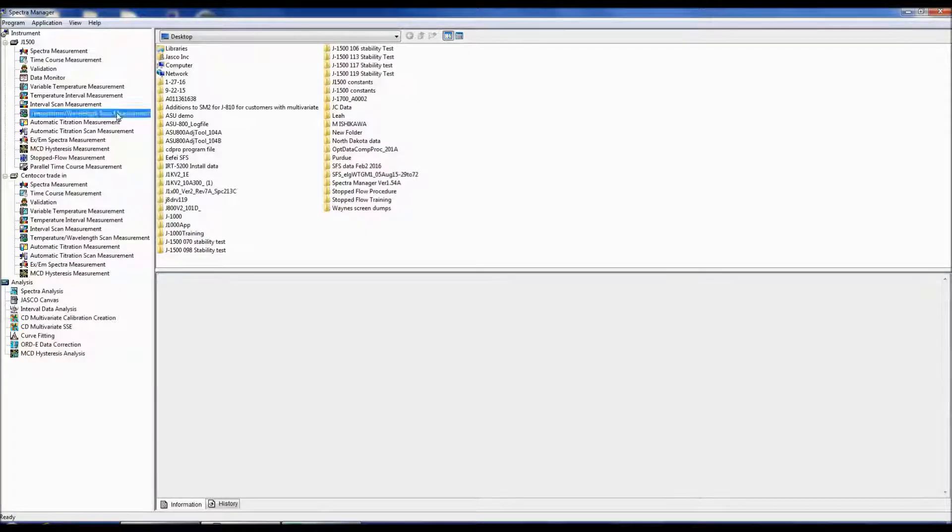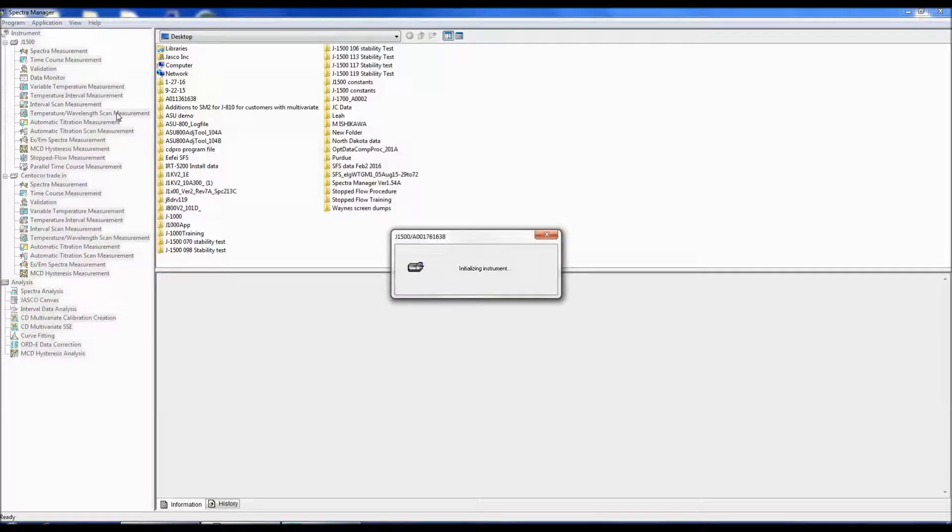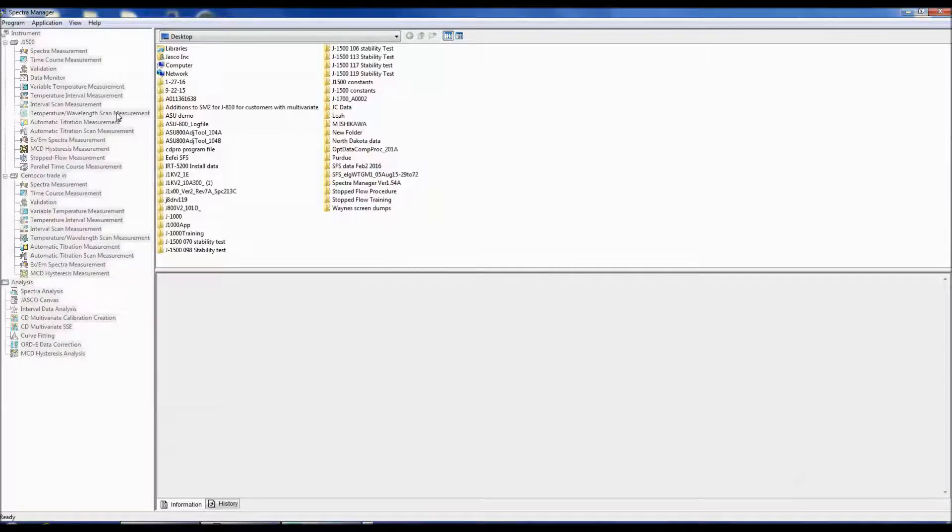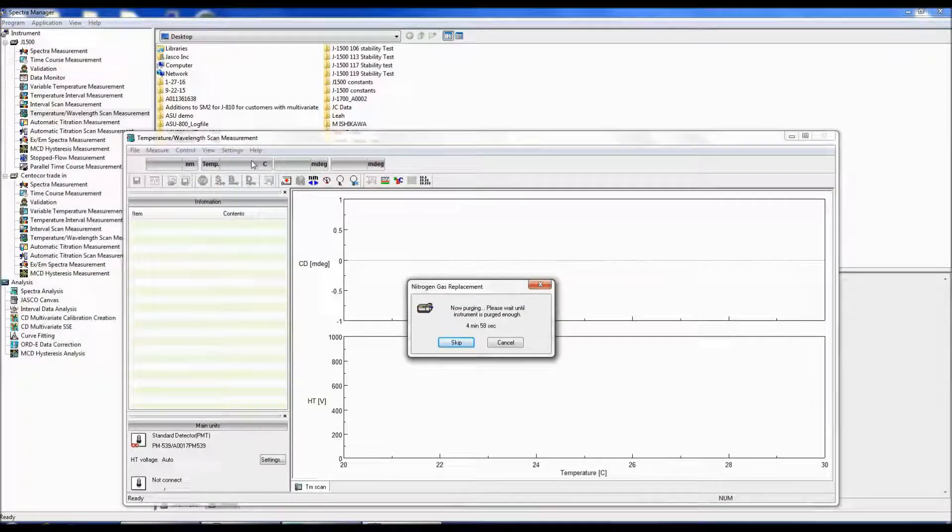The Temperature Wavelength Scan Measurement Program measures the CD spectrum at specific temperatures while also monitoring a specific wavelength at varying temperatures to obtain a melting profile.